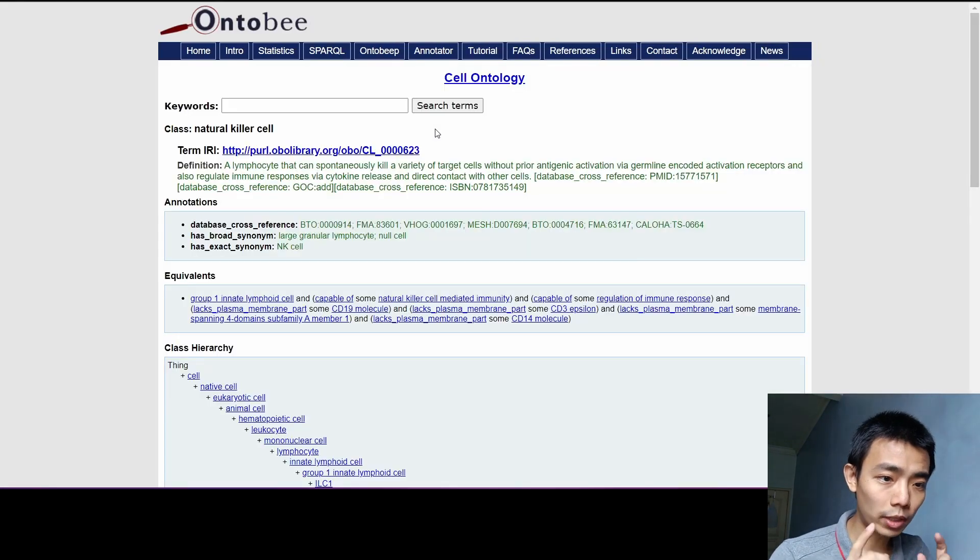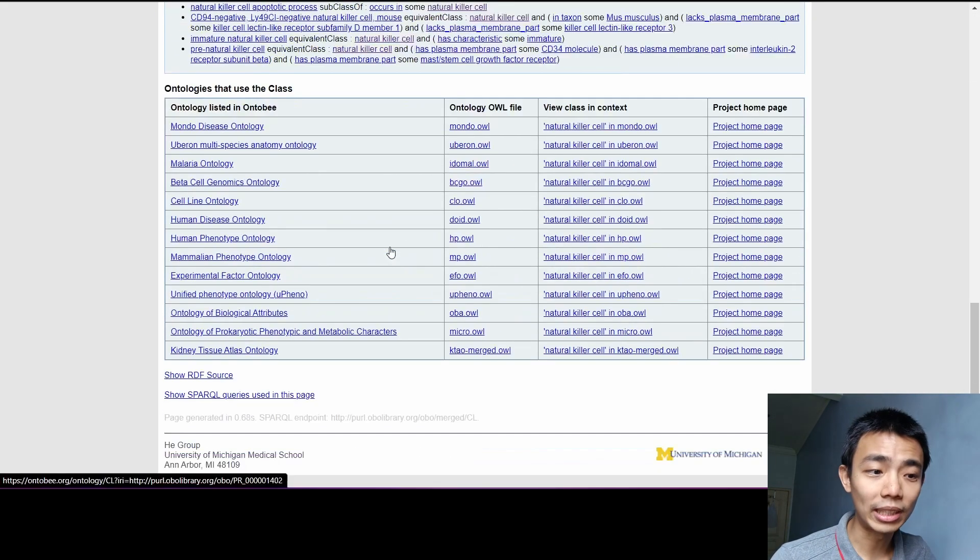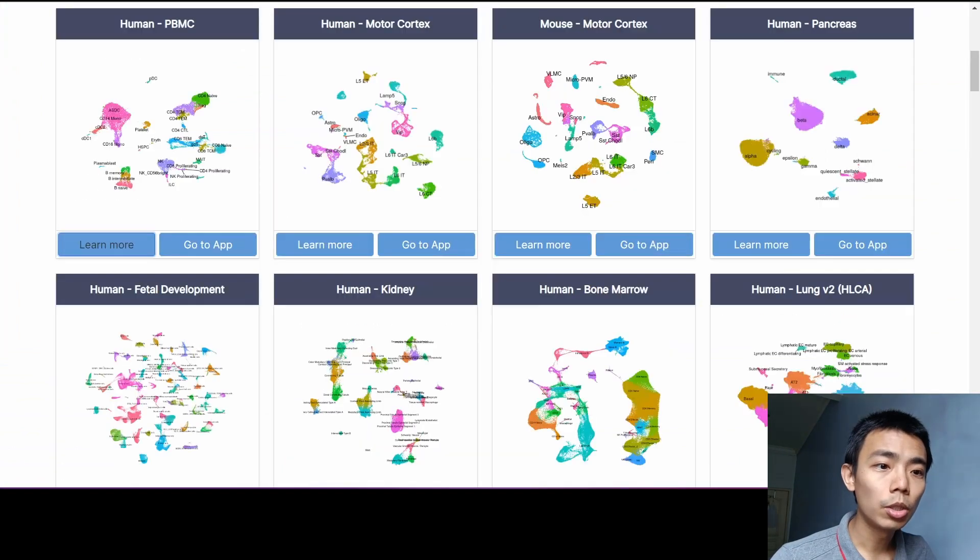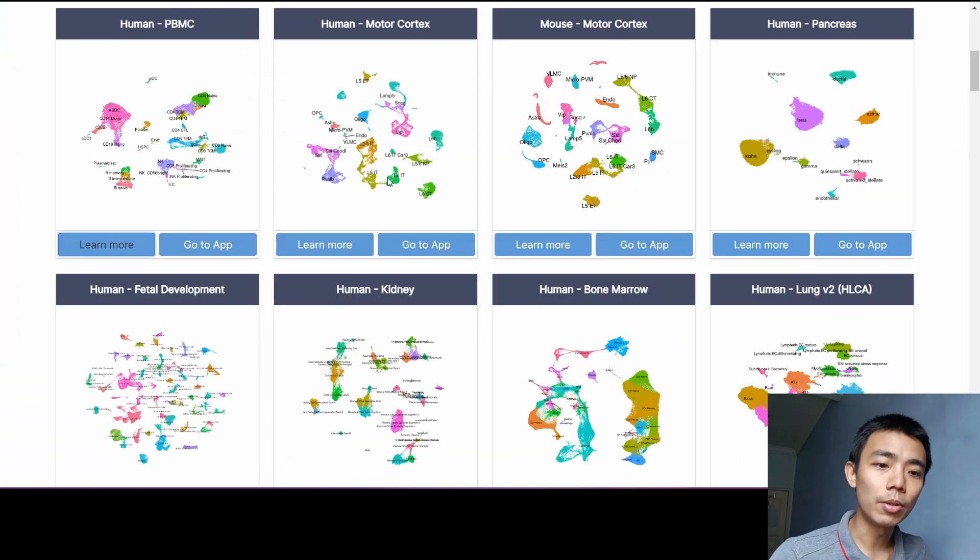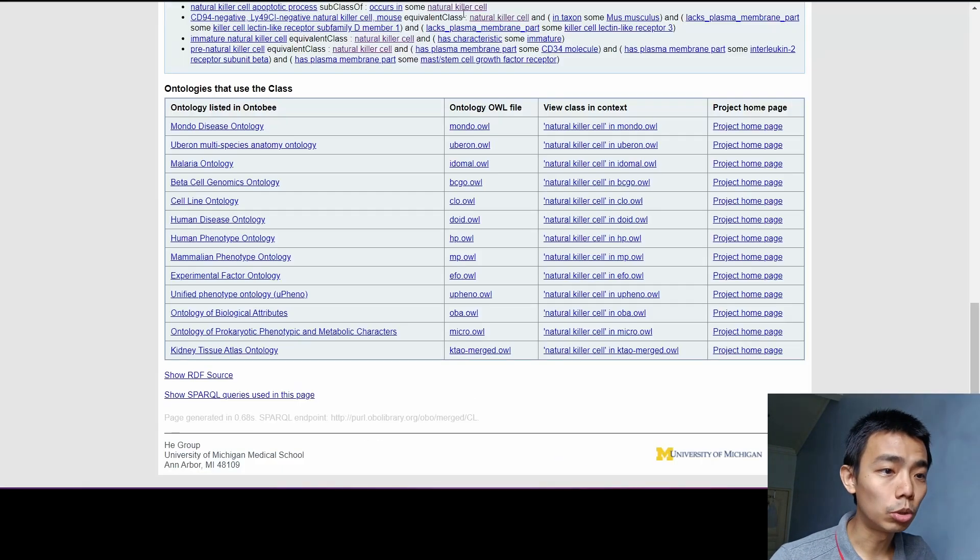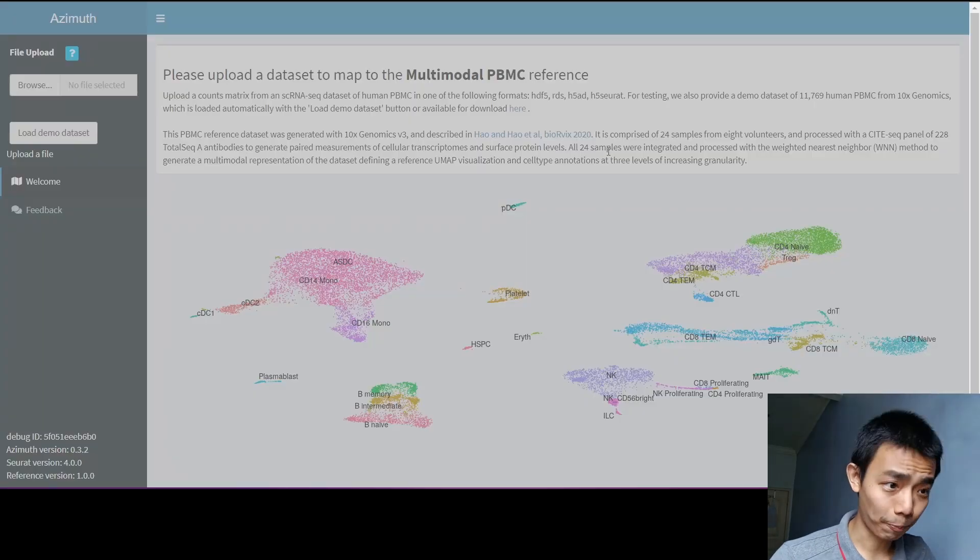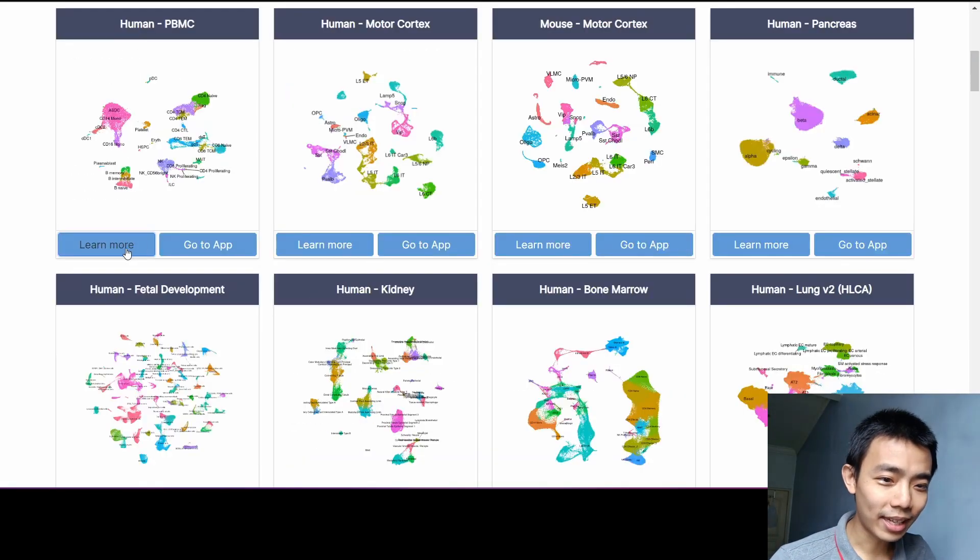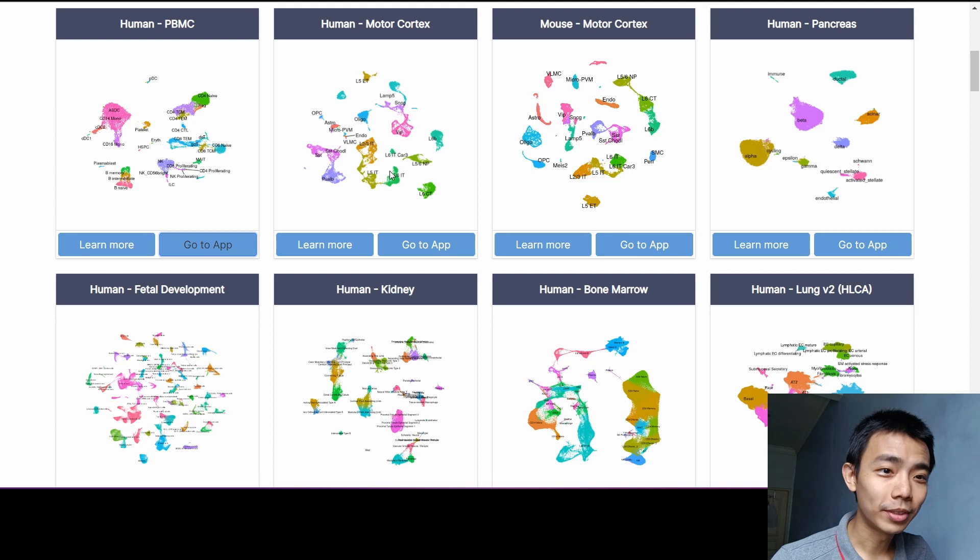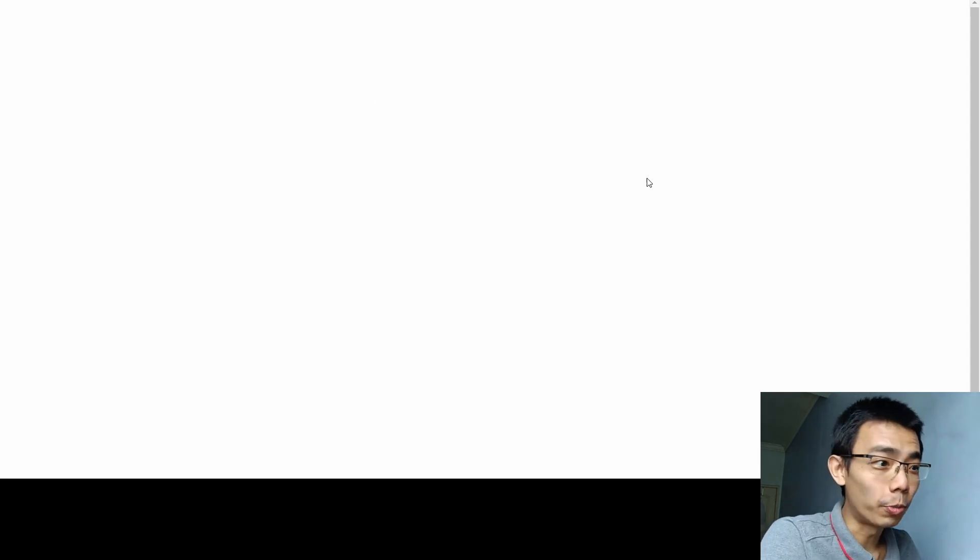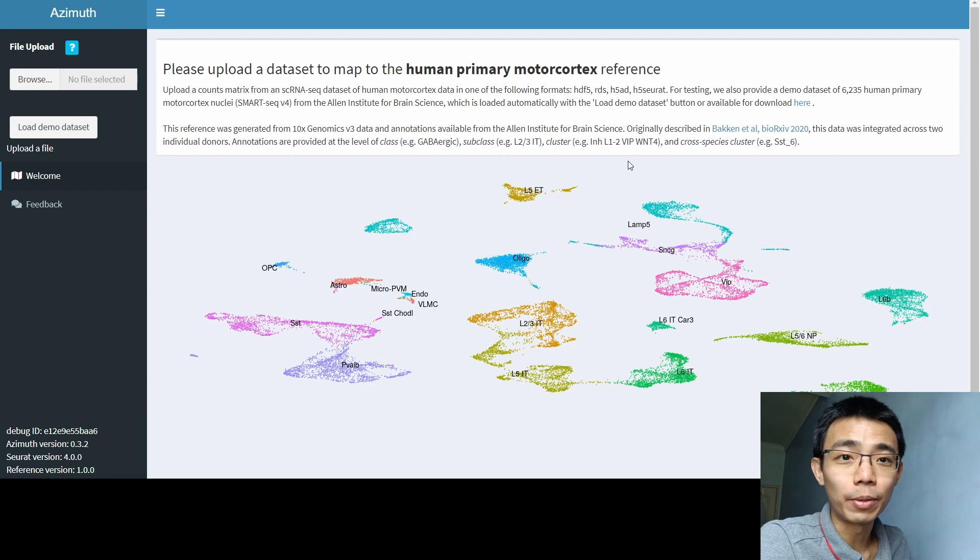And you can go deep into the ontology to actually understand the different types of cell types. My internet is a bit slow for this one, but there's a lot more information here that you can look into. Once you are ready, you can just press go to app right here. And you should bring you to something like this. After waiting for about 10 minutes, the human PBMC app is still not working. However, human motor cortex is actually currently working.